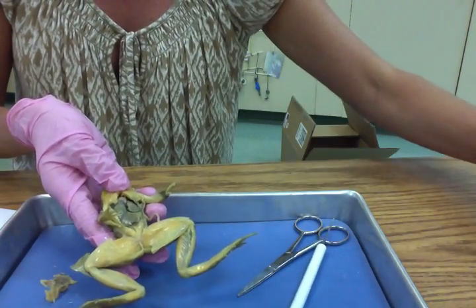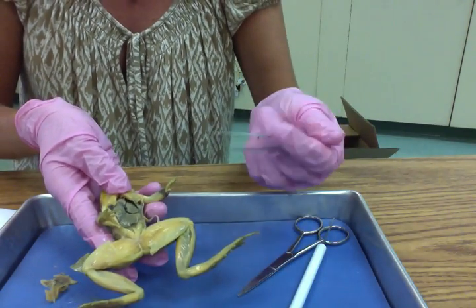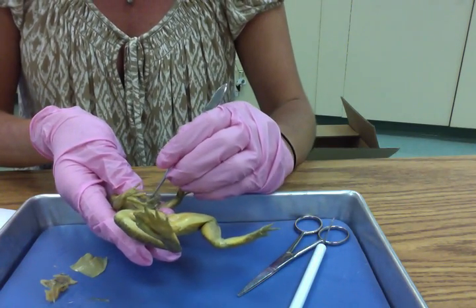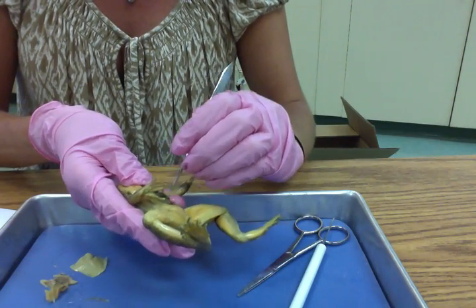Now we can use the forceps, the tweezers, to pull the liver out.